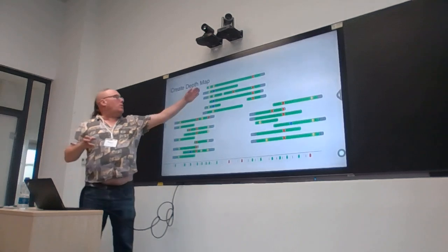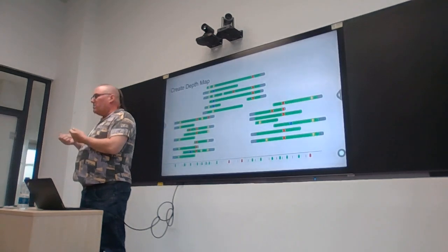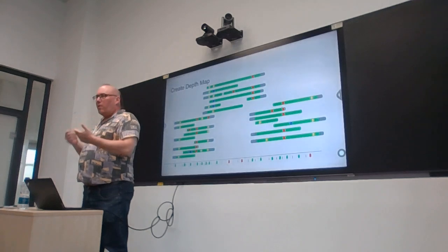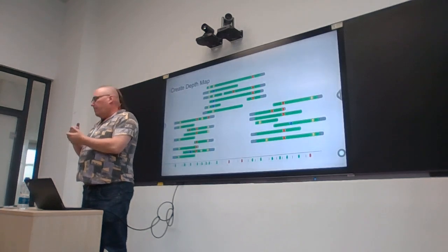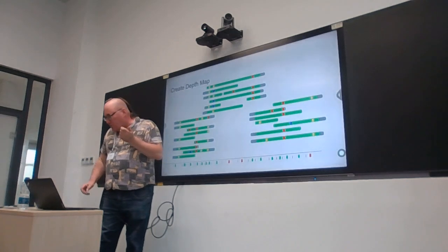So looking at allele frequencies, mixed variants, is another way to check whether your laboratory processes are running totally right. Okay, just two more things I want to talk about.